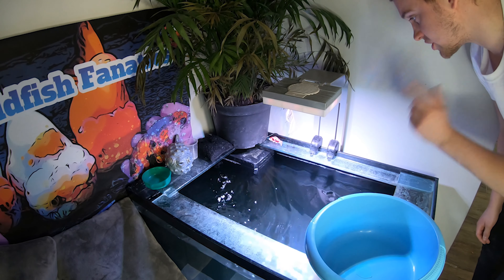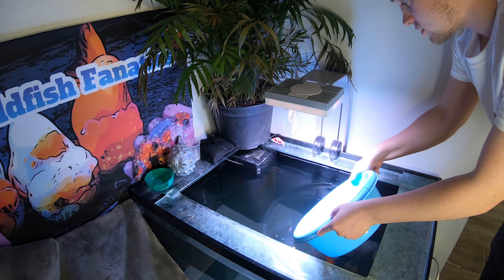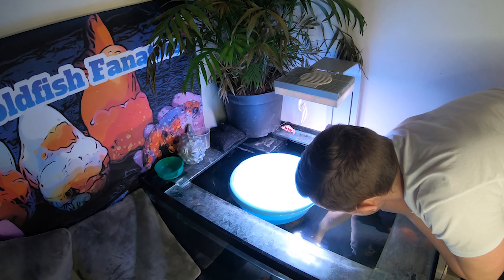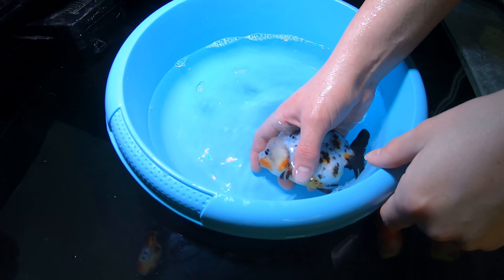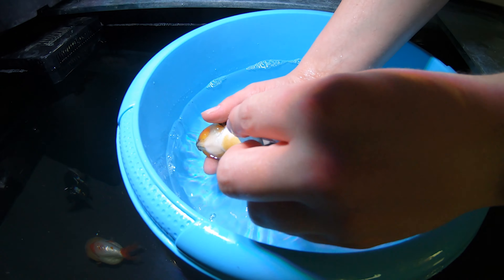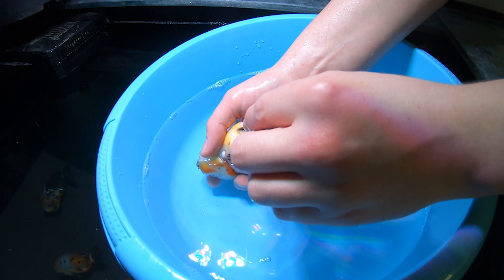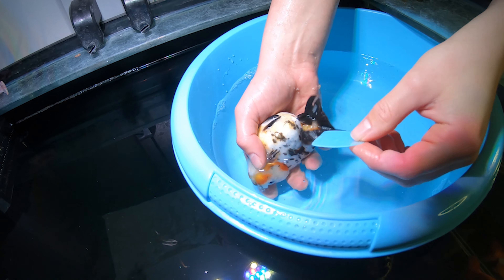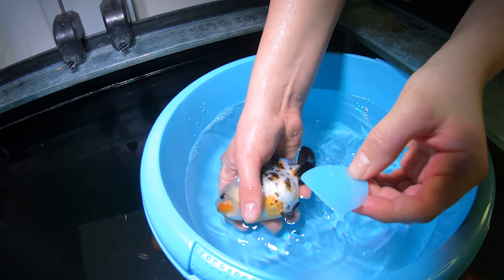I've got my little scraper and the blue bowl. First, I'm going to turn the pumps off so there's no rippling on the water, then fill the bowl up with water and get our target fish. I'm going to turn the fish upside down, wet the scraper slightly, and take a little mucus scrape from the bottom of the fish — from the base around the fins and also from the gill area.